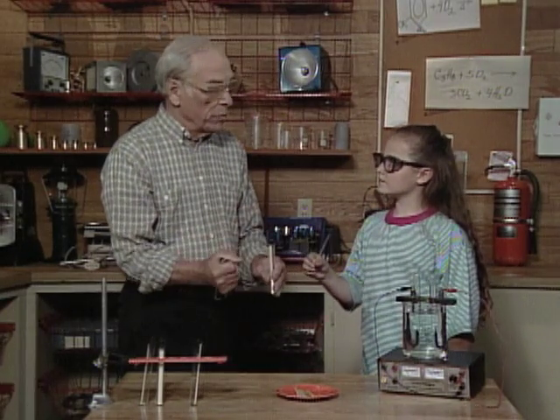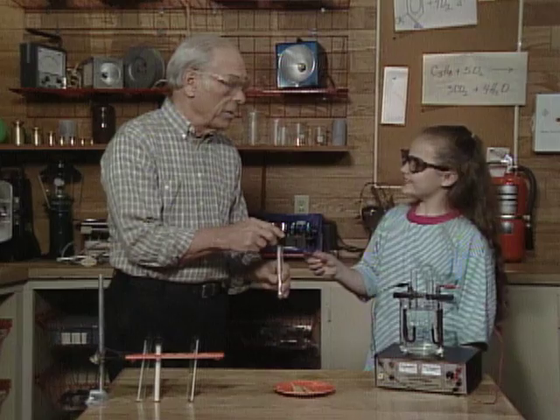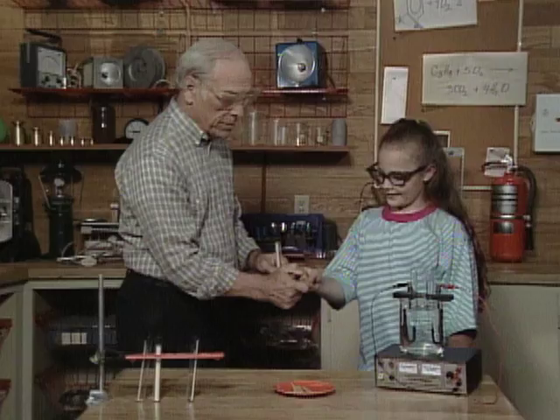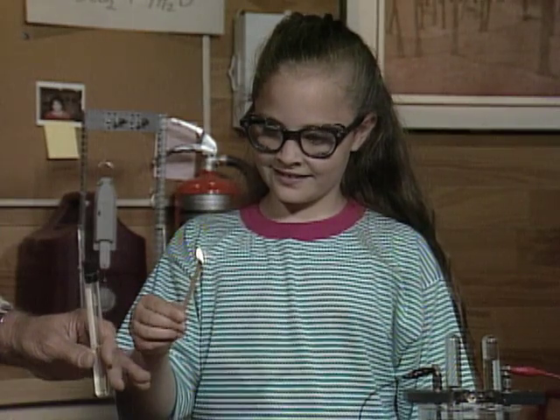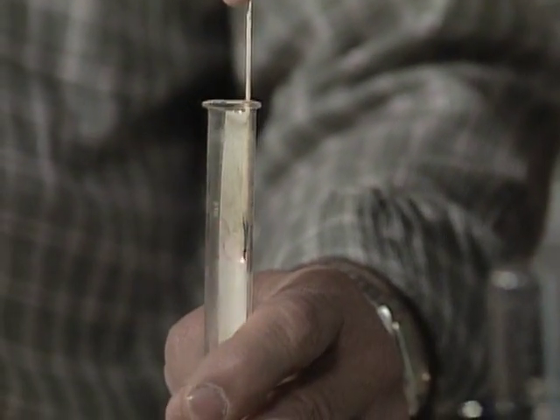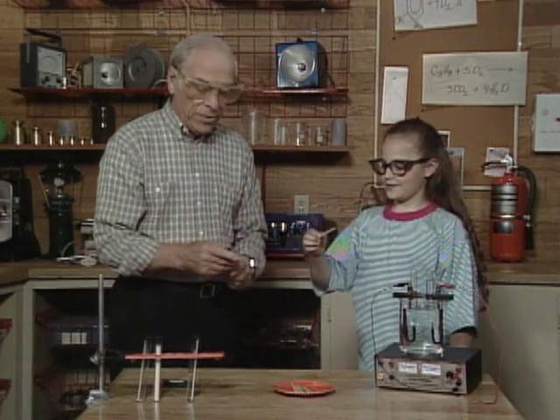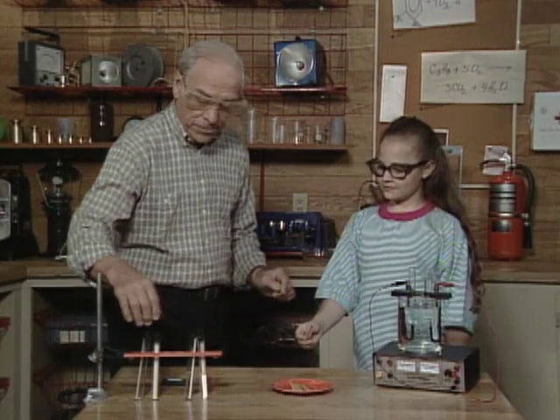What happens when something goes from burning in air to burning in oxygen? It bursts into flames — it gets hotter — because there's more oxygen to support the combustion. Okay, let's try it. Wait until it gets going... now blow it out... now stick it in here. There you go — start another fire! That definitely was oxygen.